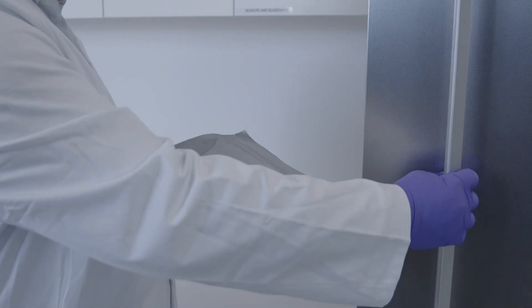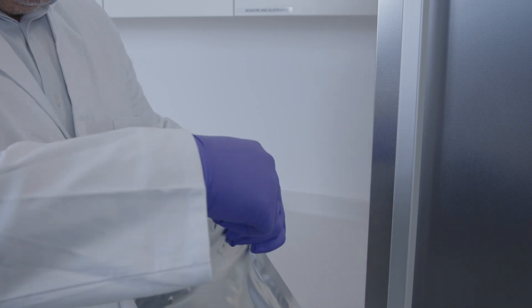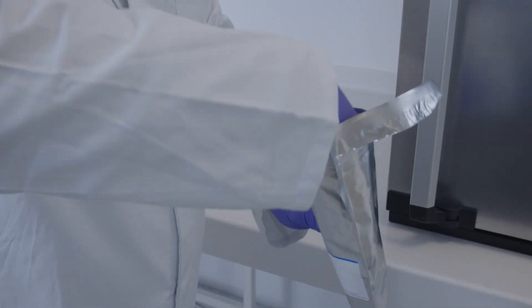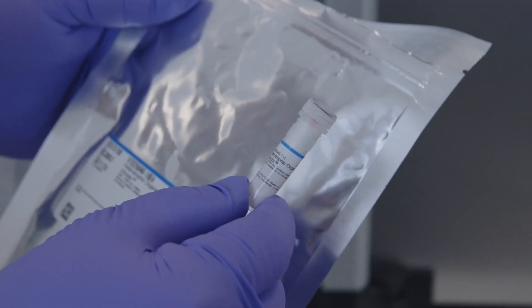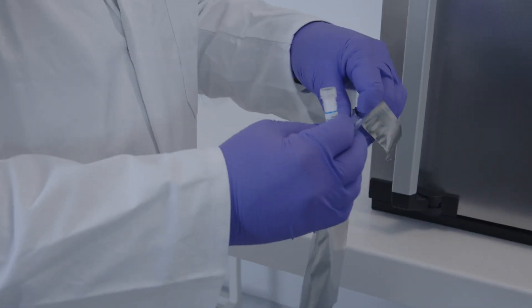When a disc is needed, open the mylar foil bag stored in the freezer and take out only a single vial. Then reseal the bag.